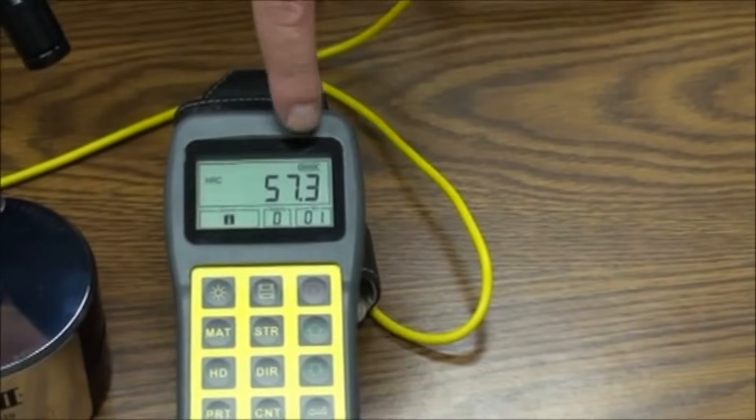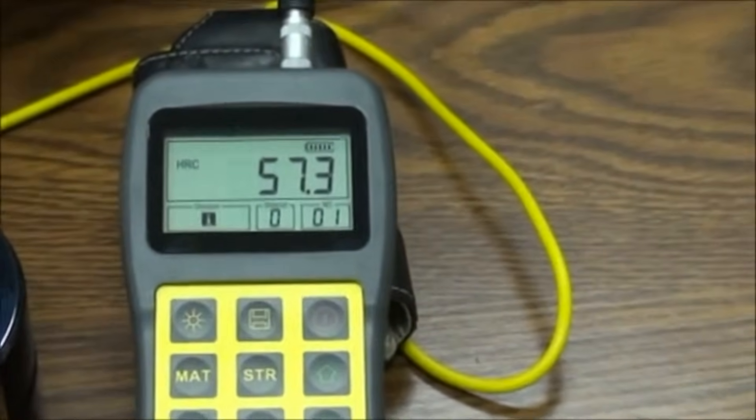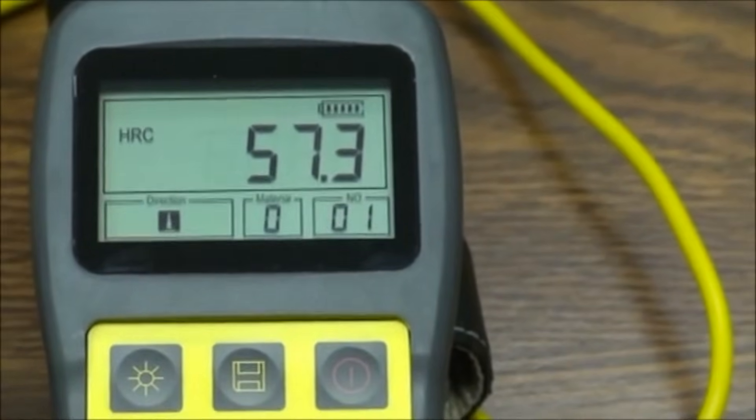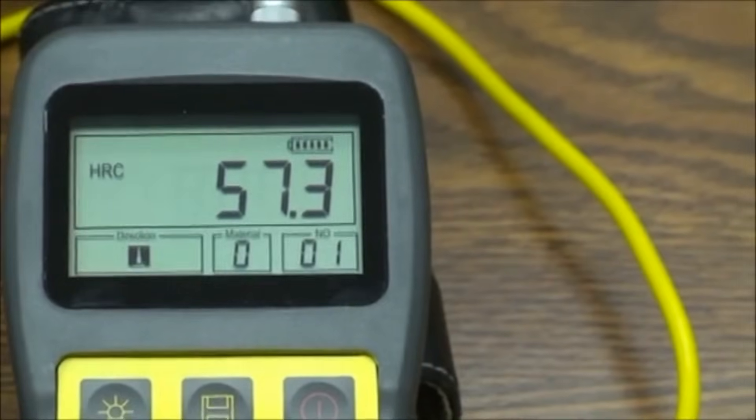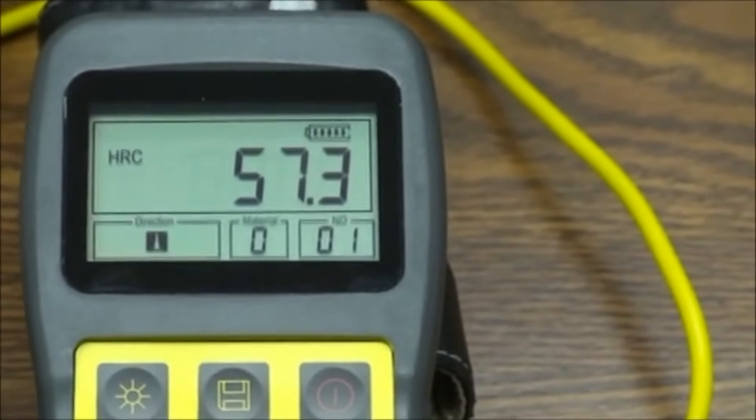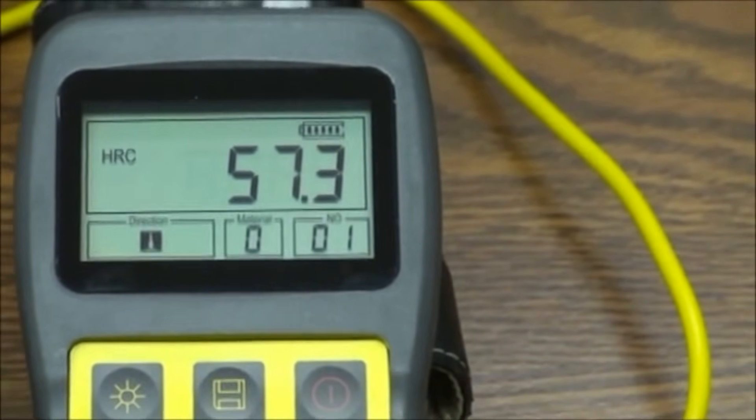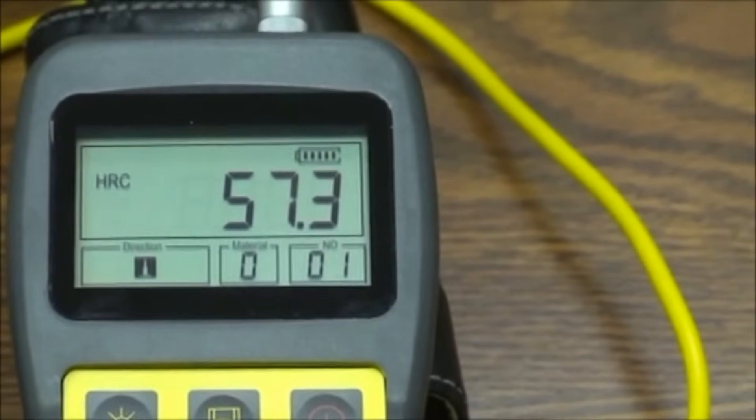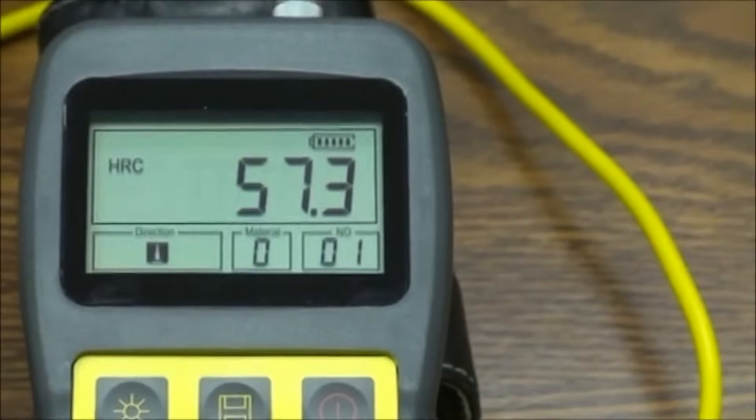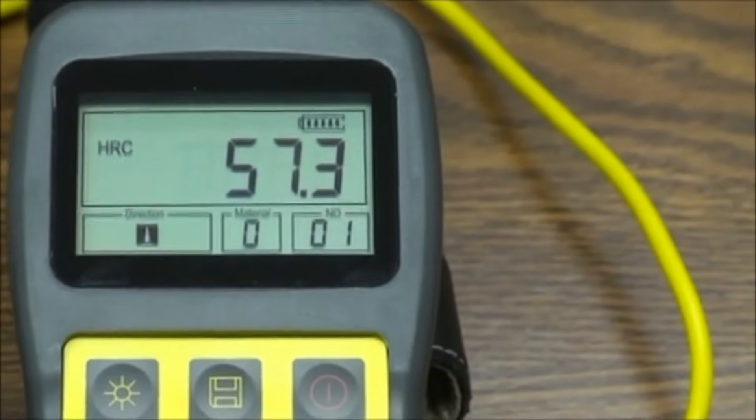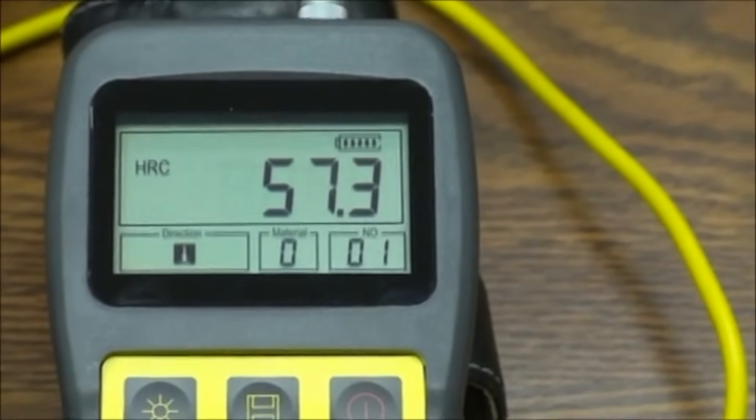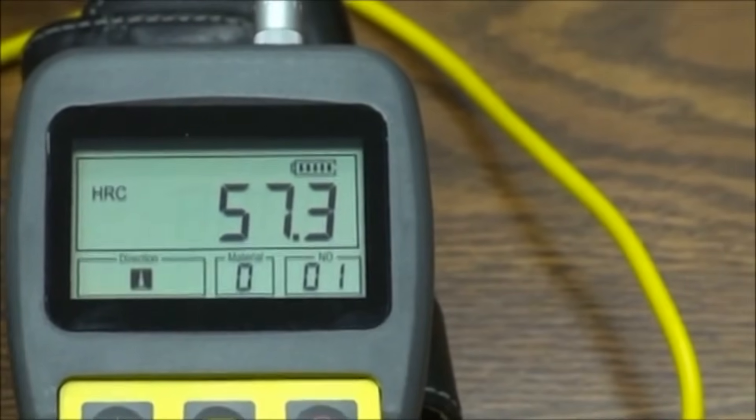You will also notice that the screen is showing your battery life, direction of probe during test, the material selected, the scale you are reading in, and the number of tests you have taken. The number will revert back to zero once you have reached the number of tests to take an average.